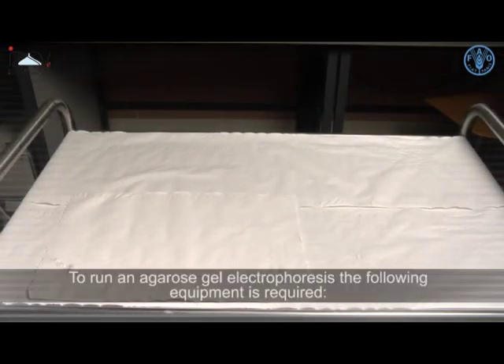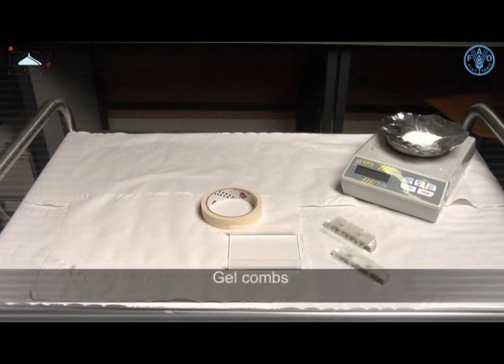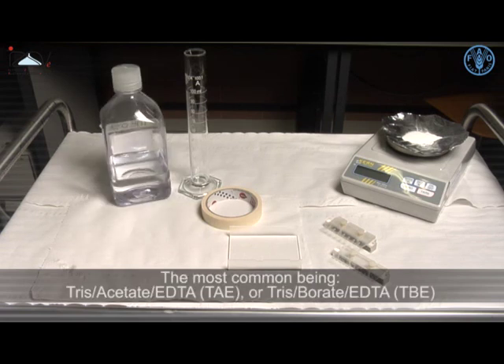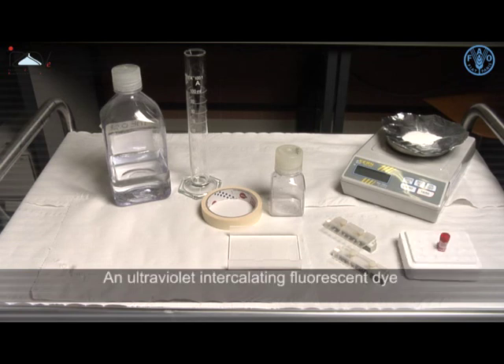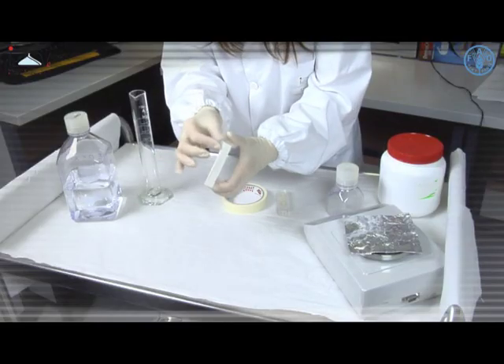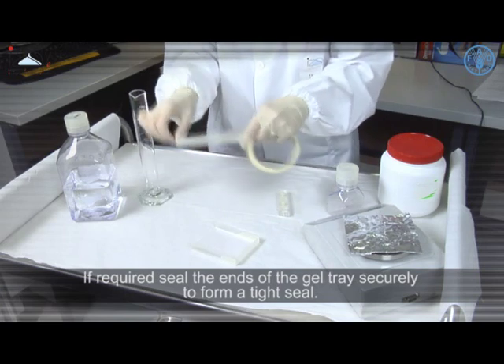To run an agarose gel electrophoresis, the following equipment is required: analytical balance, agarose, gel tray, paper, laboratory tape, gel combs, a graduated cylinder, electrophoresis buffer solution — the most common being tris-acetate EDTA (TAE) or tris-borate EDTA (TBE).